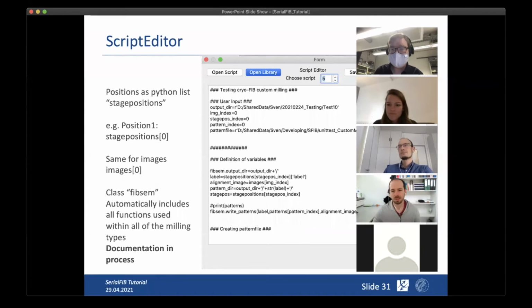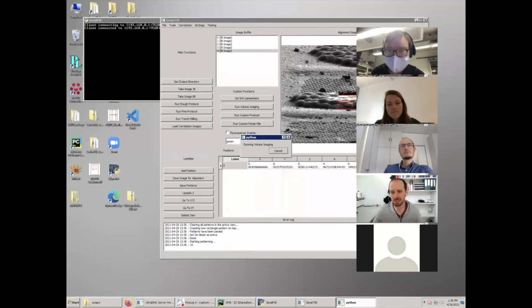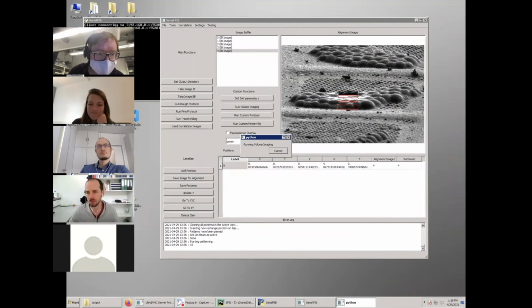Yeah, just a comment to this focusing. I was thinking, would it be possible, if you would have next to where you are imaging some lines milled into the sample, like little trenches that go quite deep, would it help, because you would have some pattern and you would then mill it as well and always focus on that pattern? But you would not use it for the imaging, but only for the focusing.